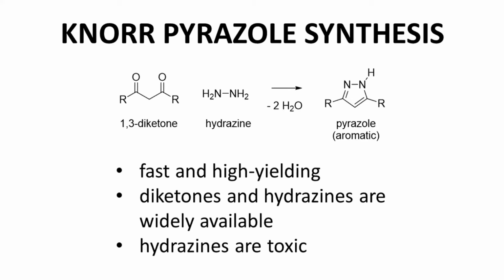The only negative things I'd say about this reaction is that the hydrazine and substituted hydrazines can be very toxic. If you've heard of hydrazine outside of a chemistry class, you've likely heard about it in the context of rocket fuel. Hydrazines are reactive, and you should protect yourself thoroughly from exposure to them.